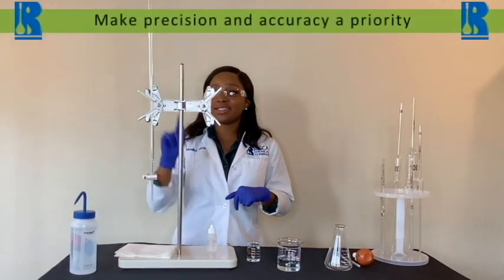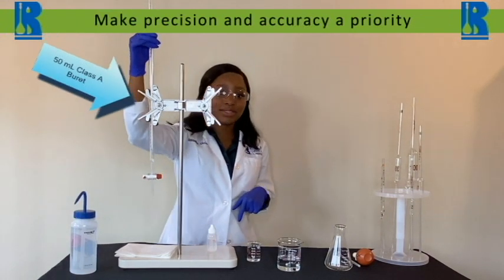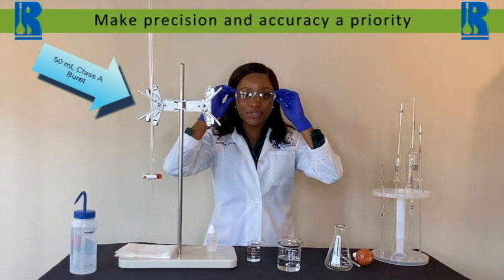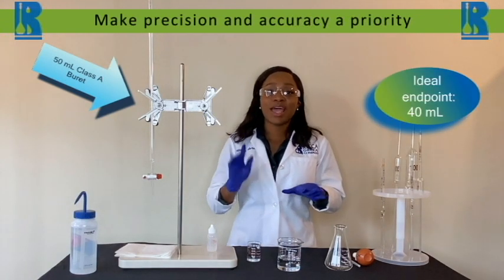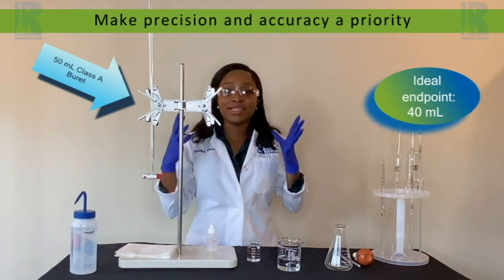In this case, our sulfuric acid is traceable to tris(hydroxymethyl)aminomethane by NIST. With manual titrations, it's best to use a 50 milliliter class A burette. Try to get as close to a 40 milliliter endpoint as possible — that will allow you to use about 80 percent of your burette, resulting in increased accuracy.